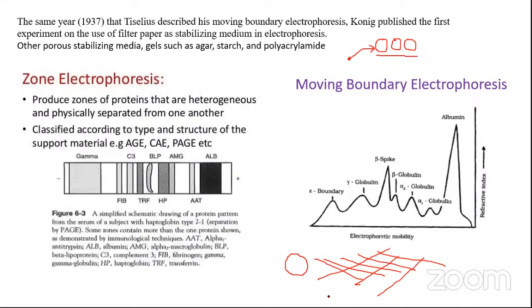So imagine this situation now. If I add extra concentration of the gelling component, then you will get such a meshwork which will be extra cross-linked. And if there is extra cross-linking, then the pore size essentially reduces. Are you getting the understanding?